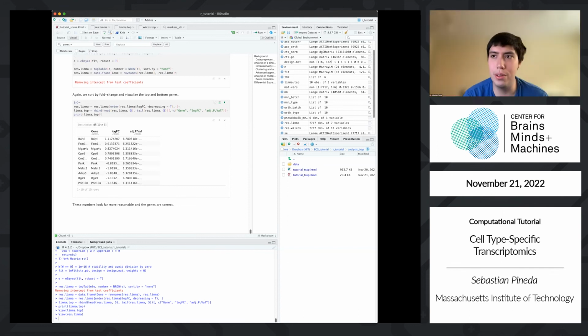Yeah. When we do this type of single cell assay, that barcoding scheme I was talking about earlier, the UMI, is actually intended to prevent exactly this. You have to amplify the library to maximize your detection, and when you do that, you're going to have very many amplicons that came from the same original transcript, but they're all going to have the same unique molecular identifier barcode. So what the aligner does is it tosses every duplicate, so that each unique UMI is only aligned and counted once.